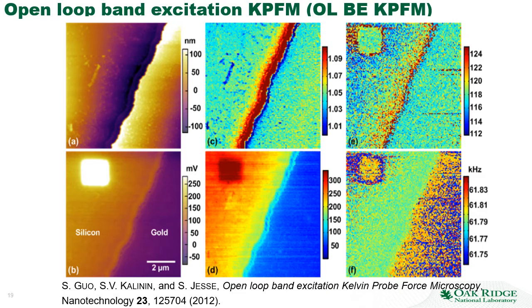So when we come close to the edge from this direction, the capacitance drops because there is a drop of the surface. But once the tip moves down the edge, then it starts to interact both with the material and the edge itself, so the capacitance goes up. So this characteristic drop down, drop up of capacitance on topographic inhomogeneities is the kind of intrinsic crosstalk of the capacitive sensitive KPFM methods.